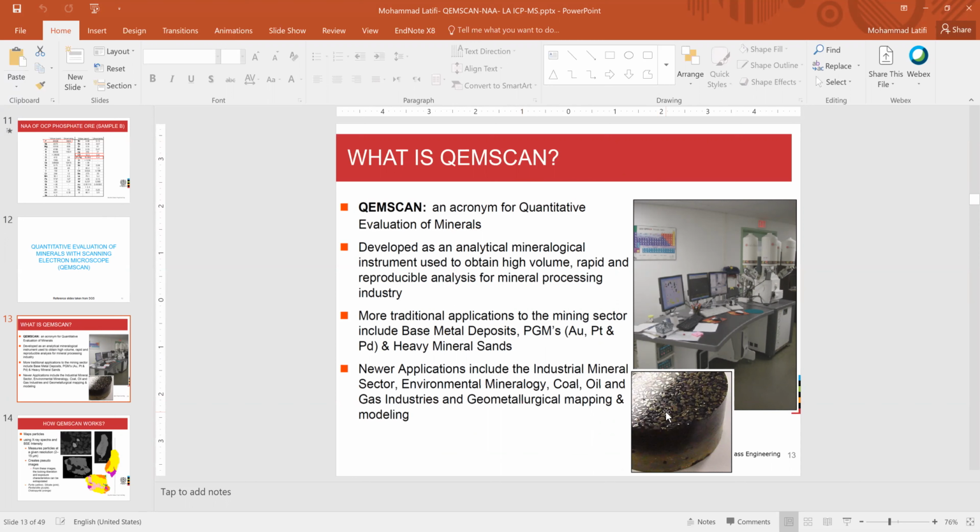Regardless, always make sure that you obtain a very reliable sample of your ore particles because they are very heterogeneous from one particle to another, from one location of, let's say, a mine to another location of the mine, or from one country to another. Ores are not similar. And if you have samples from different locations and you have mixed them, you have to make sure that your sample is prepared in a very reliable manner, as we are discussing in the course.